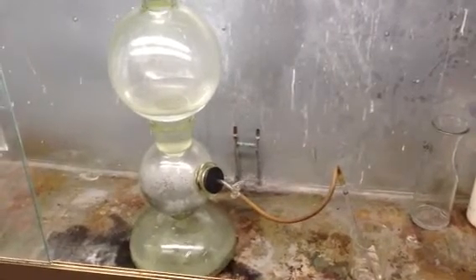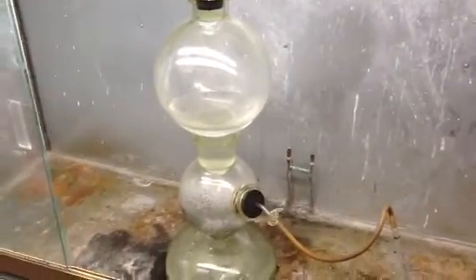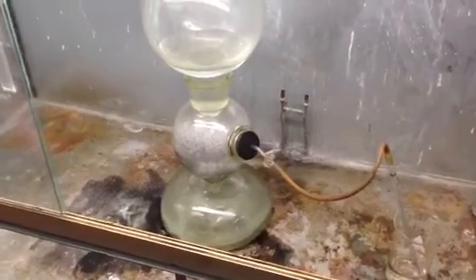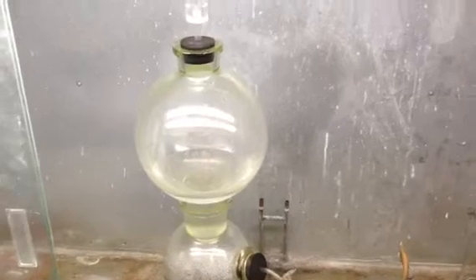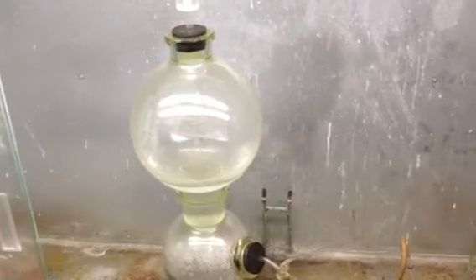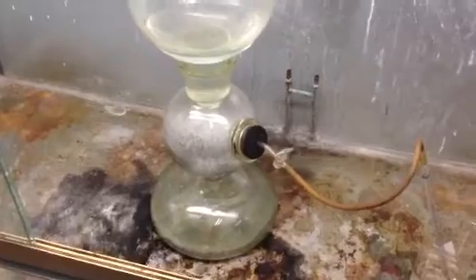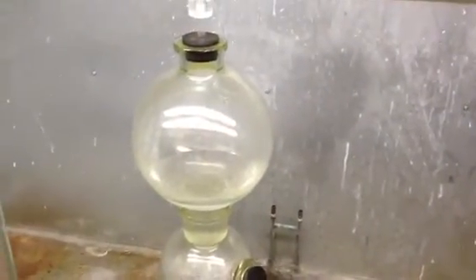Hello YouTube. I just wanted to make a video of this Kipp's generator. I've looked on YouTube for videos of them functioning and couldn't find any that were really useful — they were all just kind of animated. That's cool and all, but I wanted to see a real one functioning. This is old technology.